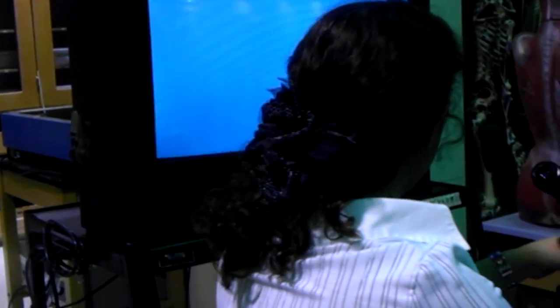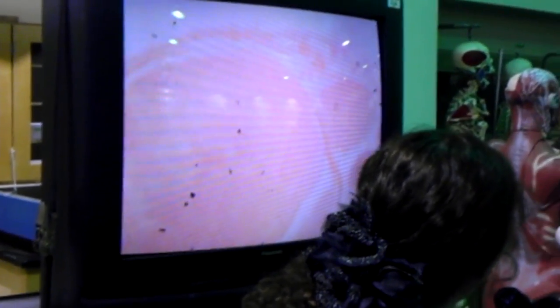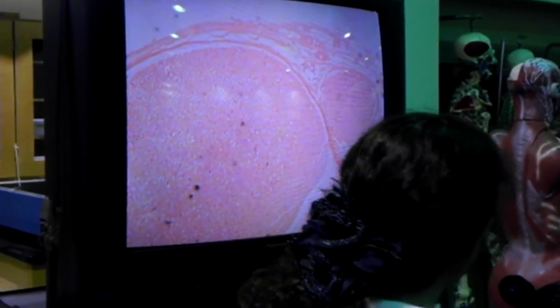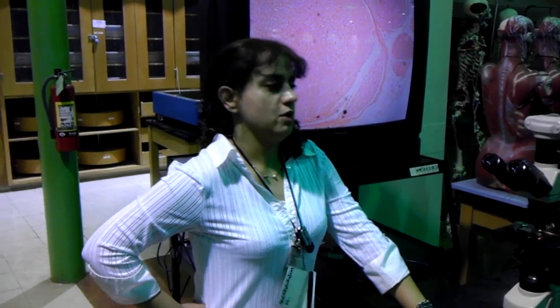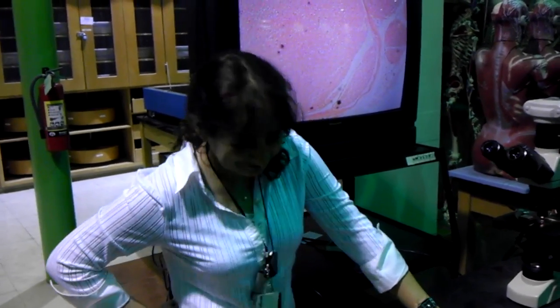If I put it here and ask you about the layer, perineurium. If I put it here, it's epineurium. Any problem? Can you point to the perineurium? It's the line around the fascicle, anywhere which is around the fascicle. But here, around the whole nerve, it's epineurium. Jason, you have a question? On the test, can you write like a dot or space around that? Right. Got it. Right.